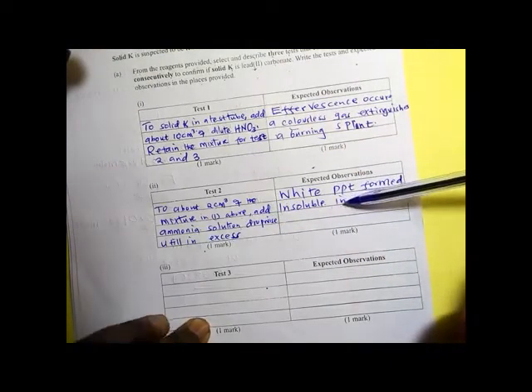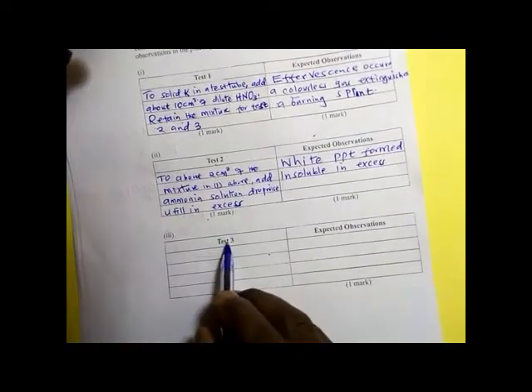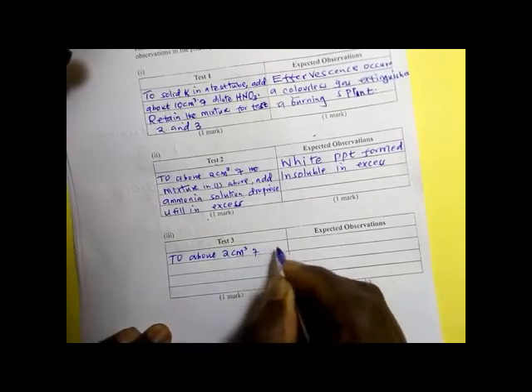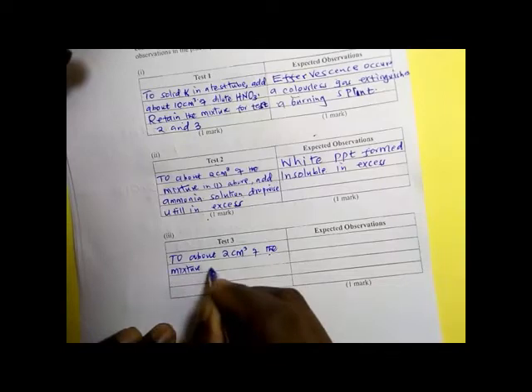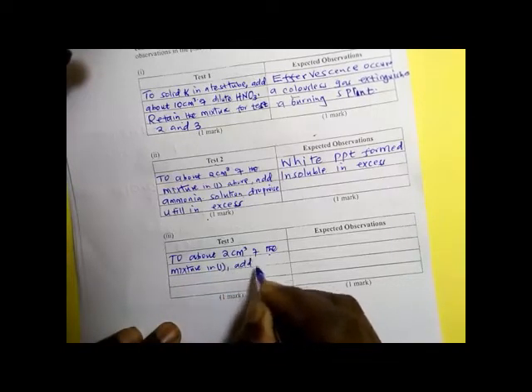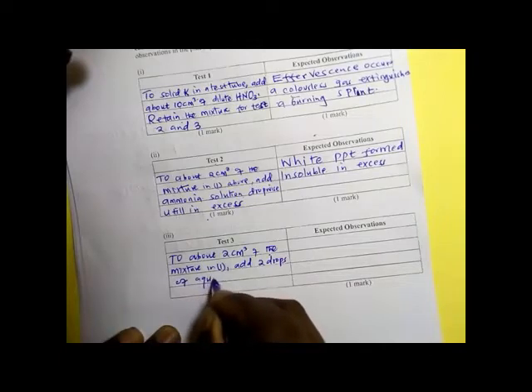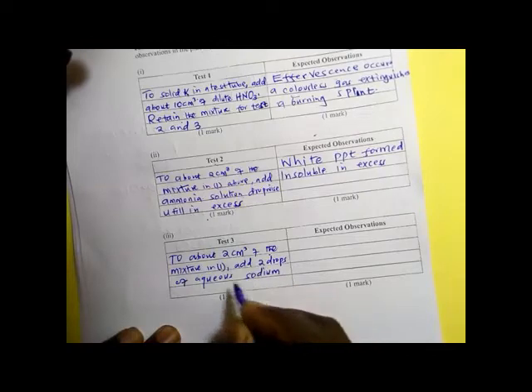Let us go to test 3. Now, to about 2 centimeters cube of the mixture in Roman 1, add 2 drops of aqueous sodium sulfate.